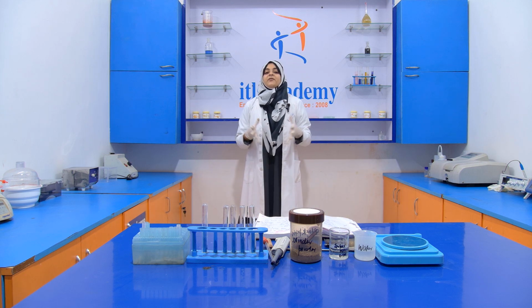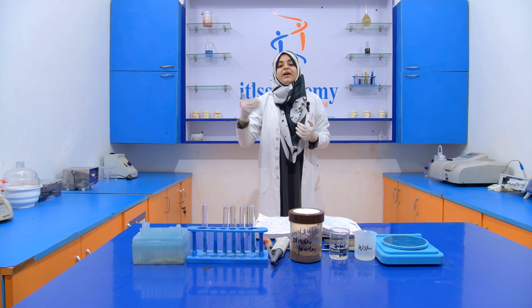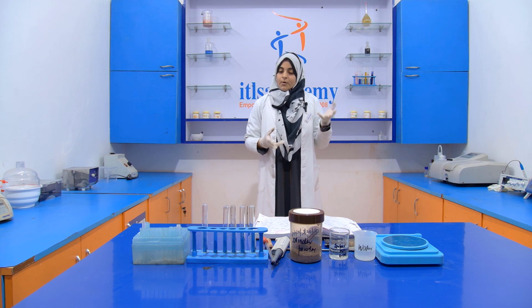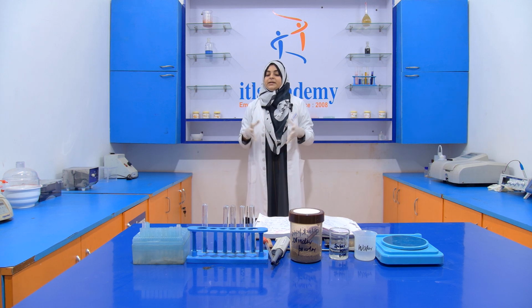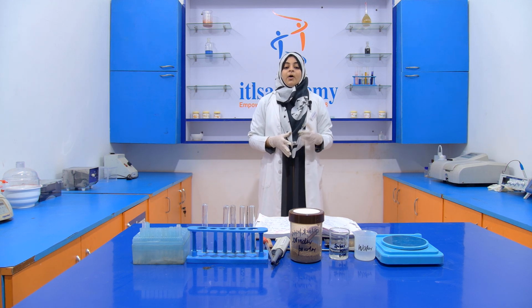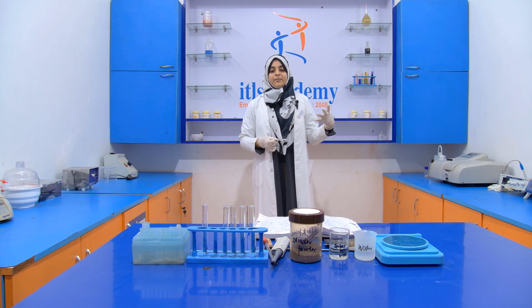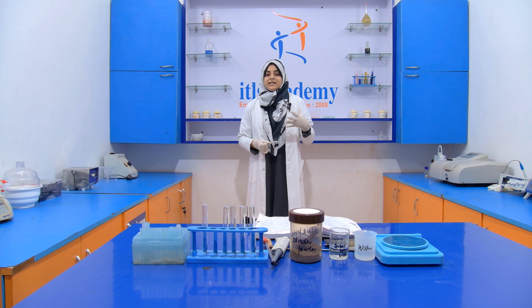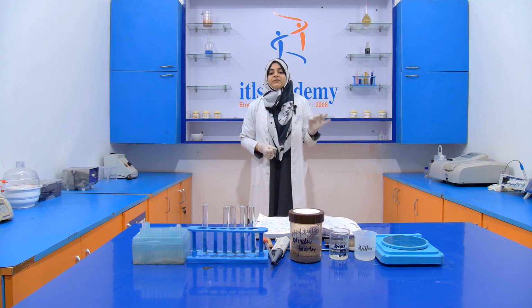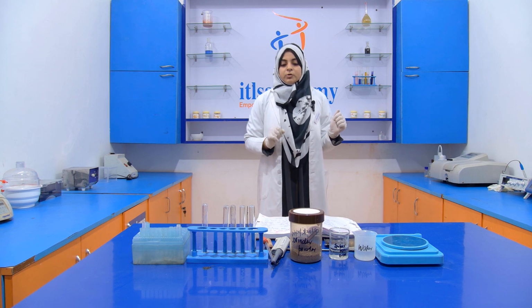Then we divide it by 1000, because if we have to prepare in ml, then we have to divide by 1000, because molarity is always per liter. And if we have to prepare in liters, then we don't need to divide by 1000. For more detail on how solution preparation takes place, you can visit our YouTube channel and see the video on solution preparation, in which we explain it very clearly. Now come to the topic.